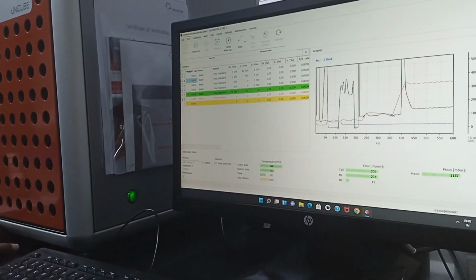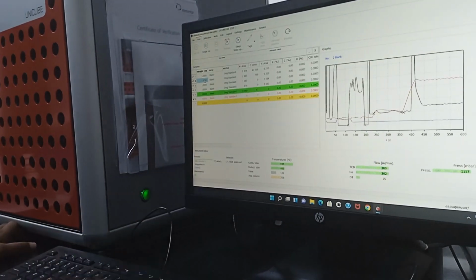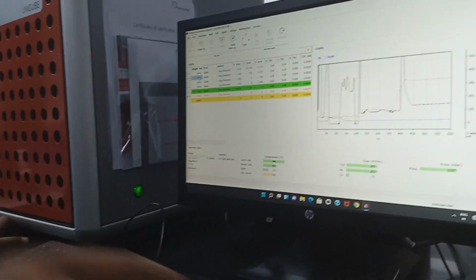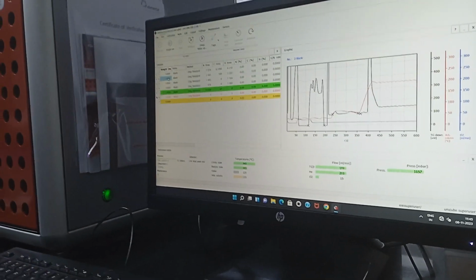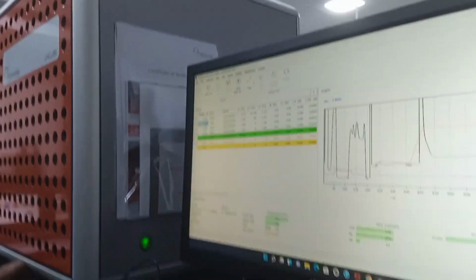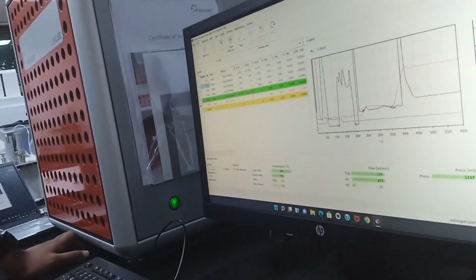In previous versions, they used to put like 000 point, point 001. Okay, so just for our reference. If I want to put another number like 2 for the blank, why would you put it? What is the reason for putting a 2 for the blank?